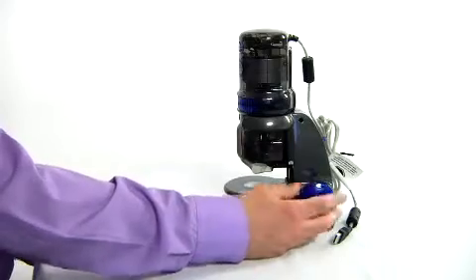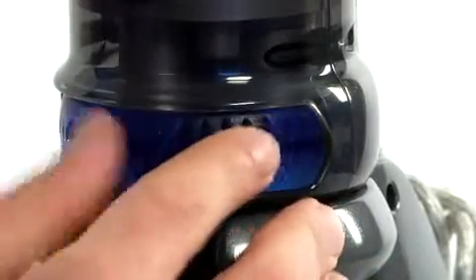Best of all, however, the QX5 allows you to magnify objects and view them on your PC at 10x, 60x and 200x magnifications.